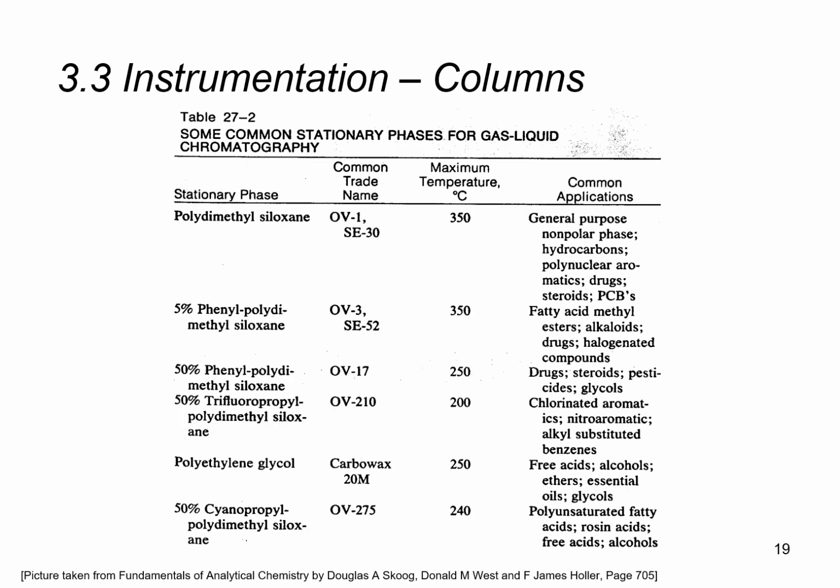Now on this slide, we see a whole list of different types of columns or stationary phases, and these are paired with a whole range of applications for these specific columns or stationary phases. So I would first of all not recommend that we remember or memorize these different types of columns and their various applications.